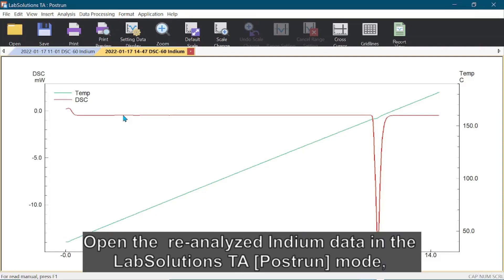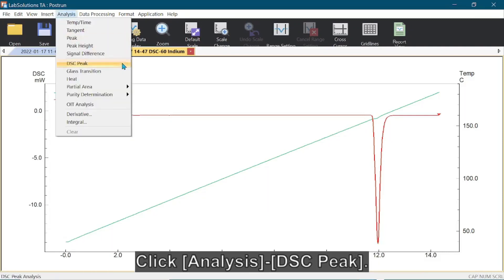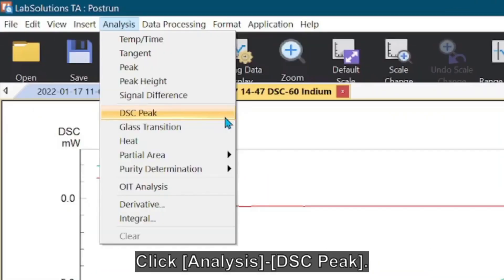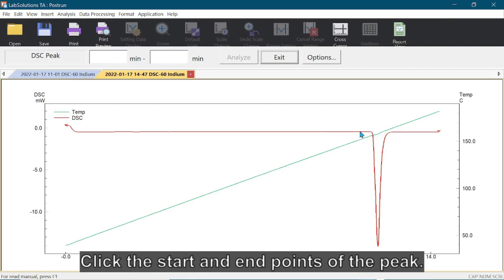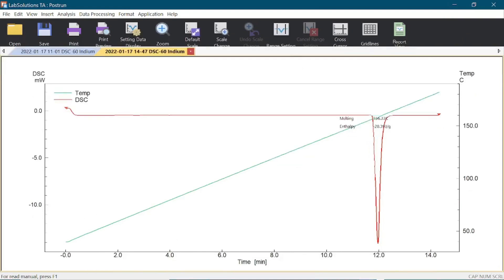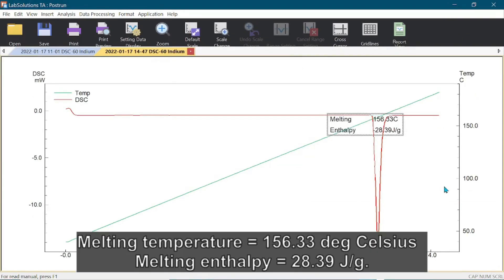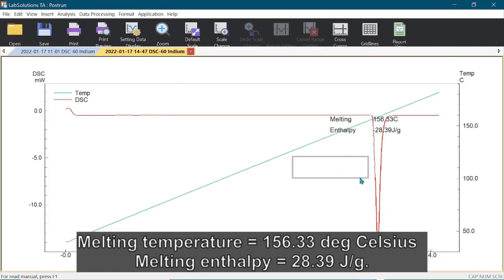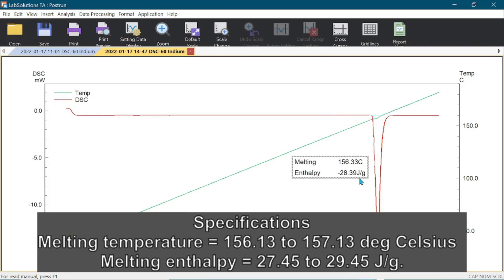After the indium is re-analyzed, open the indium data in the LabSolutions TA post-run mode. Analyze the indium peak. The melting temperature was 156.33 degrees Celsius, whereas the melting enthalpy was 28.39 joules per gram. As the results are within specifications, the DSC is calibrated correctly. If not, repeat the calibration process.